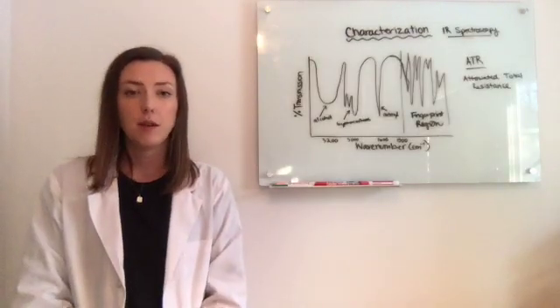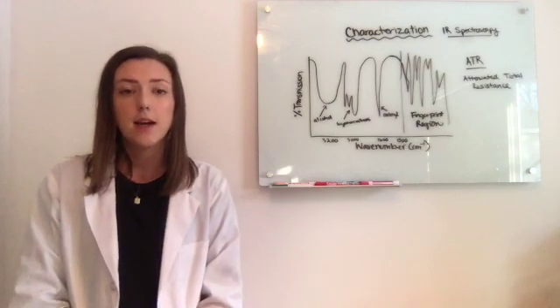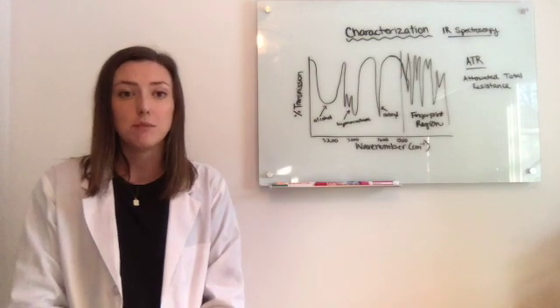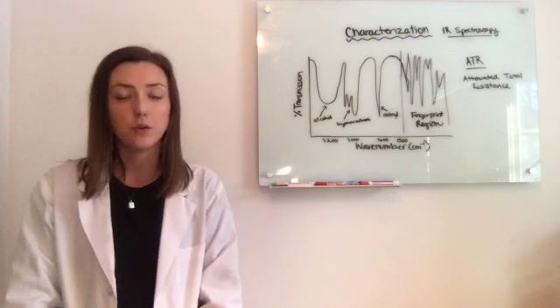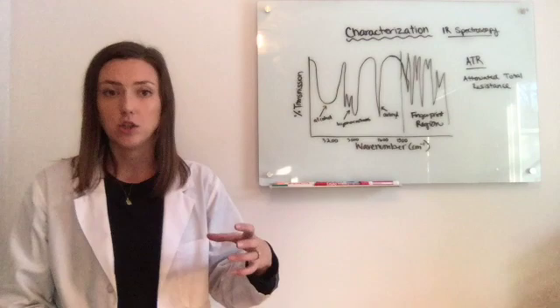So we're just going to take a few minutes to look at the last few techniques that we use for characterizing solids and liquids in the lab. This one's called IR spectroscopy, or infrared spectroscopy. It's basically just a machine that shines light through the sample. The one that we use has attenuated total reflectance, so you have the ability to just put liquid or solid directly on the plate and let the machine shine light through.